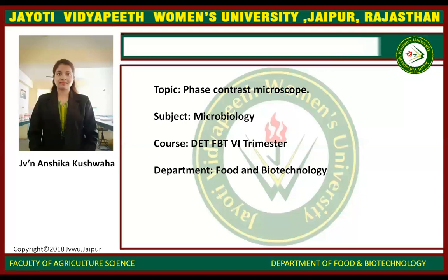Phase contrast is obtained with the help of the annular diaphragm by separating the central direct ray from the diffracted rays. The ring-shaped illuminating light that passes the condenser annulus is focused on the specimen by the condenser. Some of the illuminating light is scattered by the specimen. The remaining light is unaffected by the specimen and forms the background light.